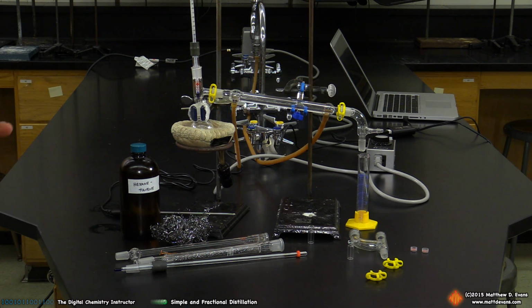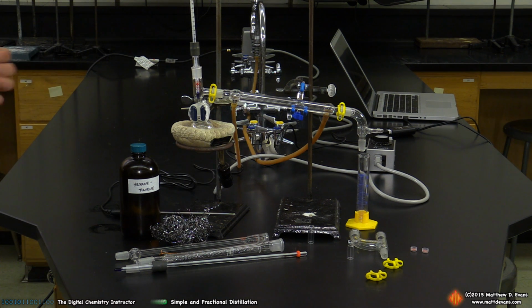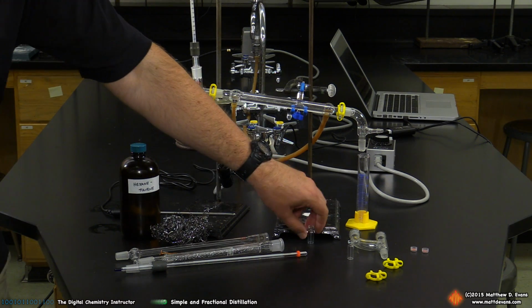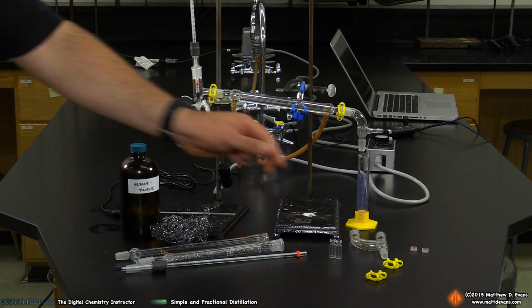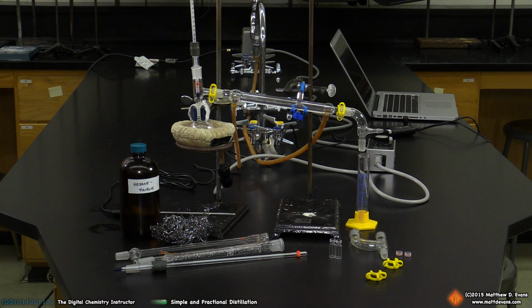Try not to heat the setup too fast. If you go too fast with this distillation, you're going to get crummy results on the other side. You won't get clean separation. The bottom line is we don't expect good separation from simple distillation compared to fractional distillation, but don't go too quick on this. Don't try to rush it, okay? Don't forget to collect your little fractions at the 4 milliliter mark and also the 18 milliliter mark. These are the caps that go on these little vials, so you'll want to cap those as soon as possible.